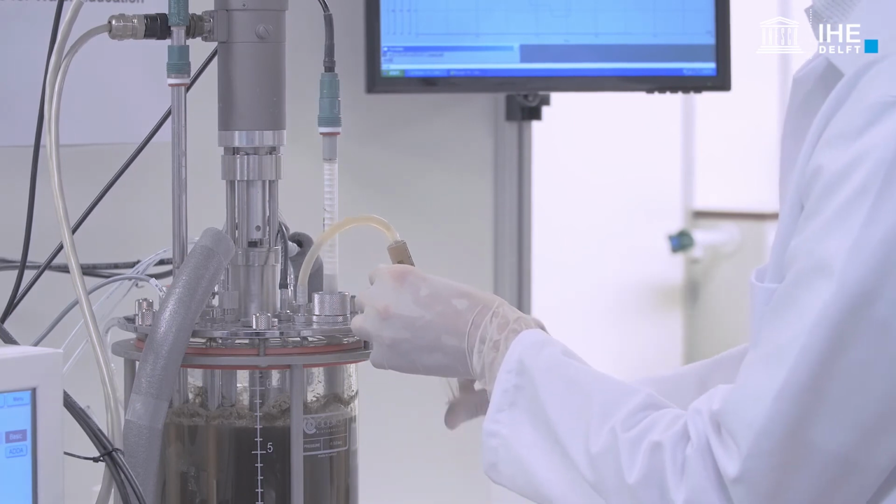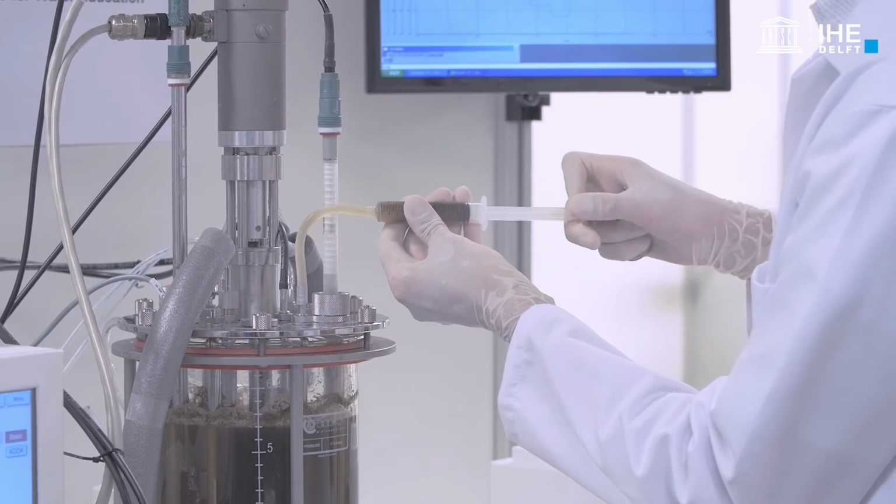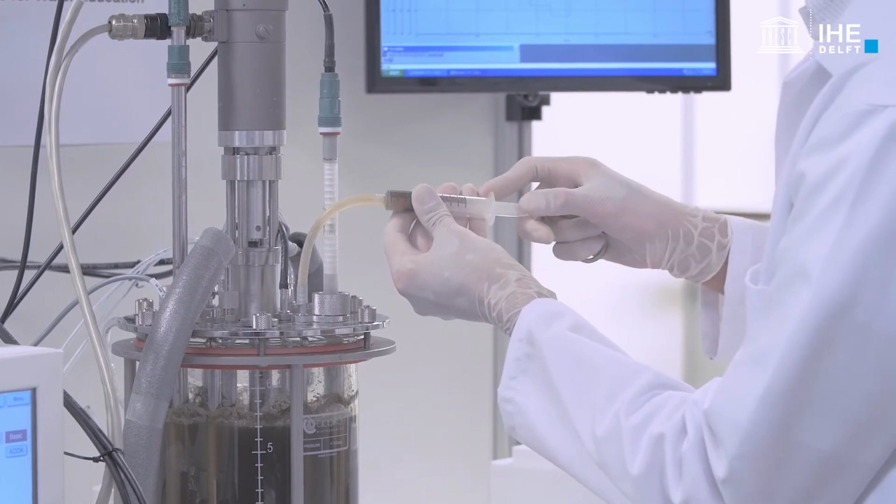Thereby, collect the last required samples following previous recommendations for the determination of particulate and soluble compounds.